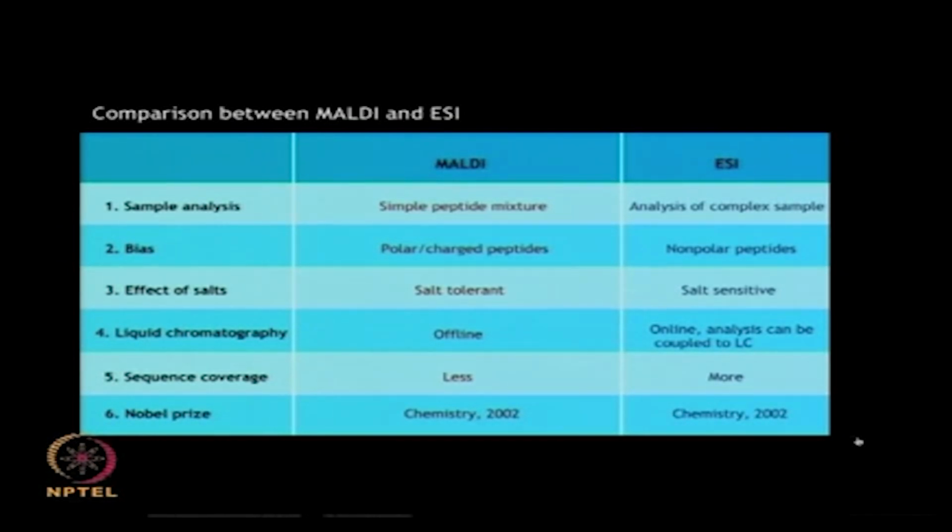MALDI is more salt tolerant, whereas ESI is more salt sensitive. Liquid chromatography can be performed offline in MALDI, whereas in ESI it is online and analysis can be coupled to the liquid chromatography. For proteomic applications, the sequence coverage is less in MALDI as compared to electrospray ionization. Both MALDI and ESI developments were awarded with the Nobel Prize.